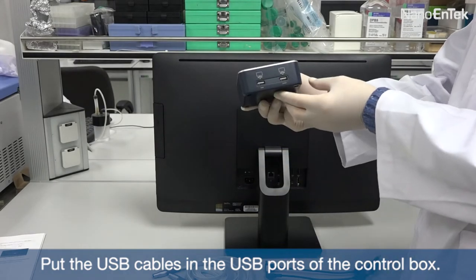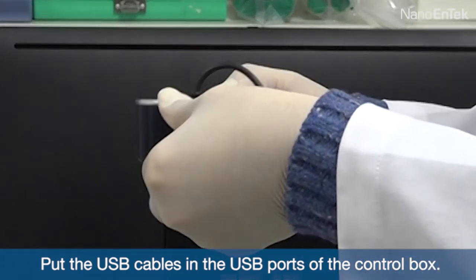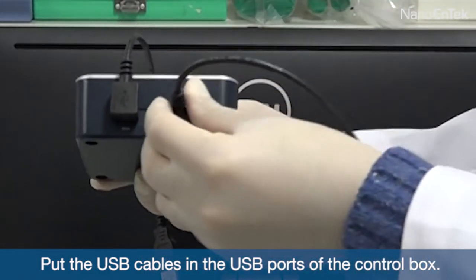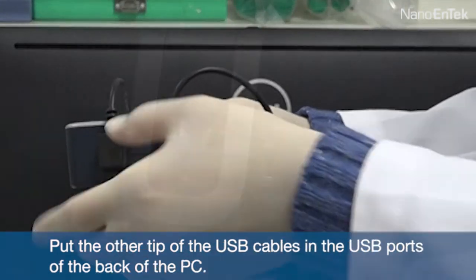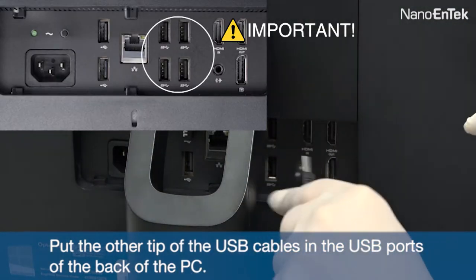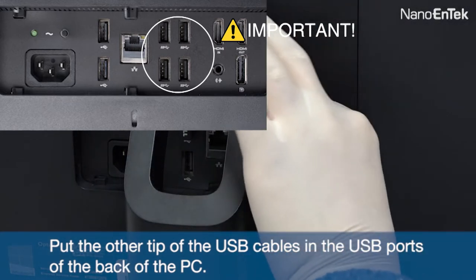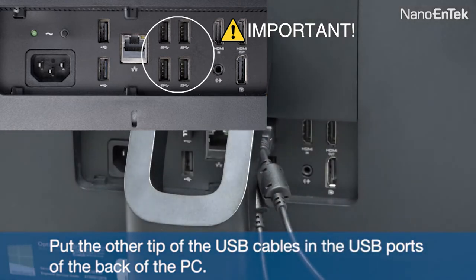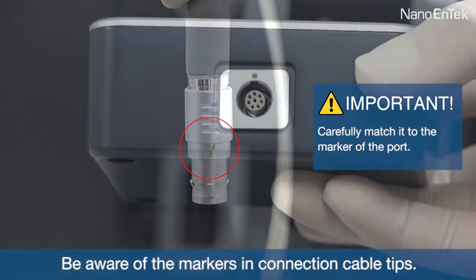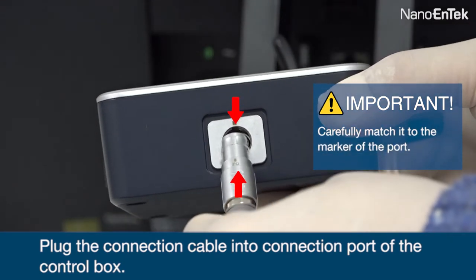Put the USB cables into the USB ports of the control box, then put the other end of the USB cables into the USB ports on the back of the PC. Be aware of the markers on the connection cable tips, then plug the connection cable into the connection port of the control box.